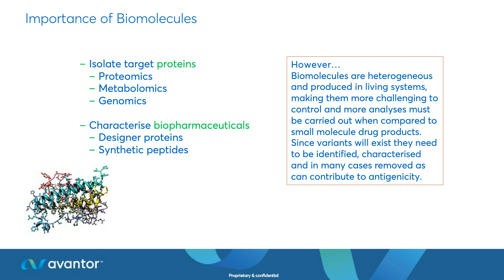And chromatography is a fantastic tool to do that. 95% of the protein is going to be the same in all of these variants. We just have to try and find that 5% that's differing. So we're going to have a look at how chromatography can help us with that.